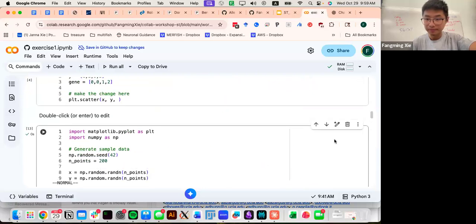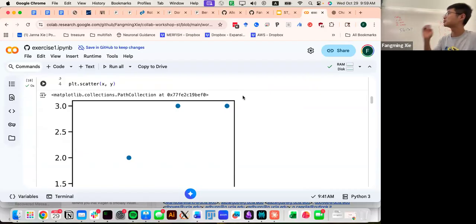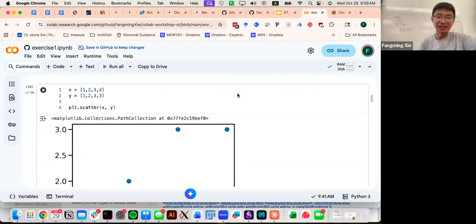So I will be coding right here. Hopefully I just show you one technique, maybe now the most important technique of how to code. One is to know you can type, and the other is to know how to raise a question to an AI chat box and then copy and paste the answer, and you can verify and tweak it.